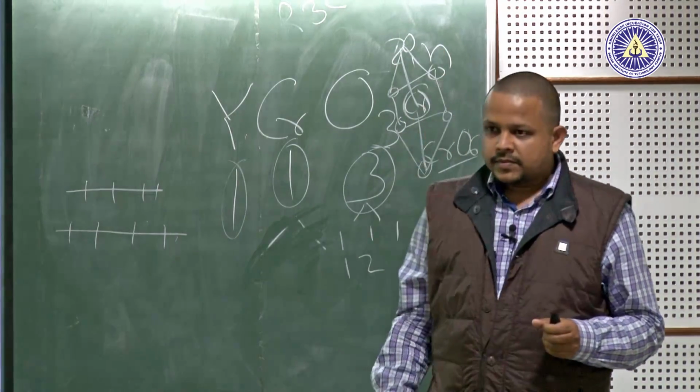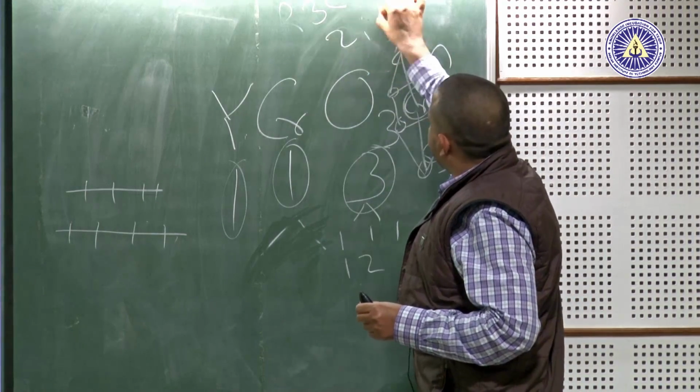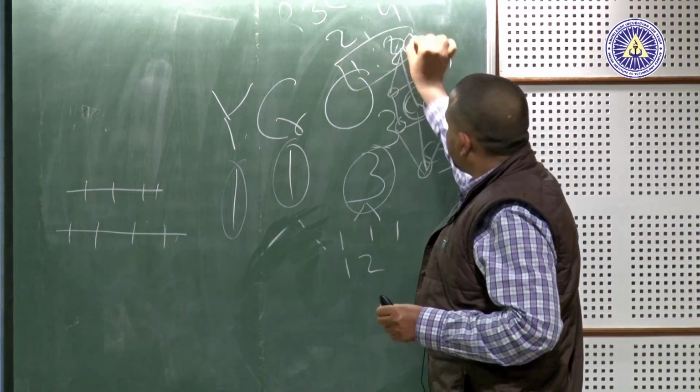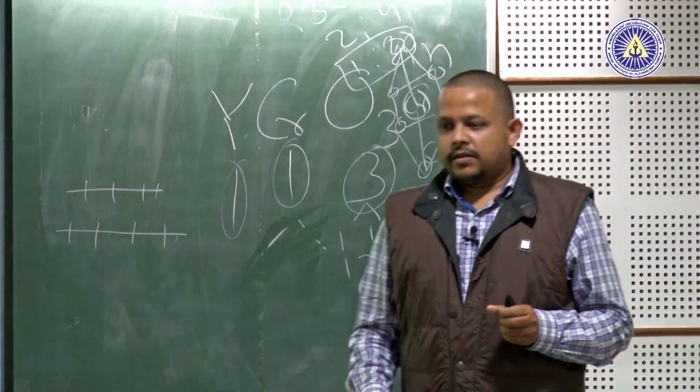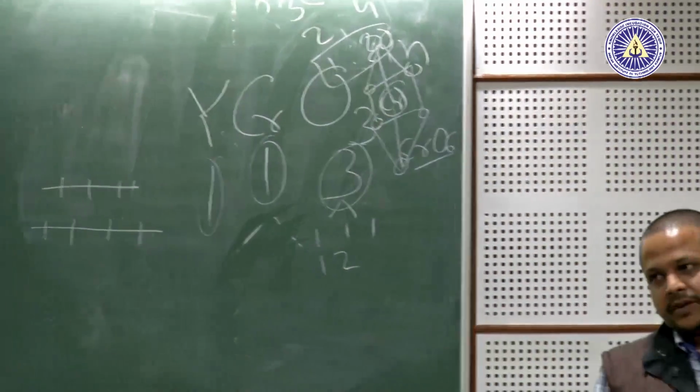Then the ratio of oxygen 2 to 4 is 1:2, and you can search a different way, maybe it will be good for you and me also.